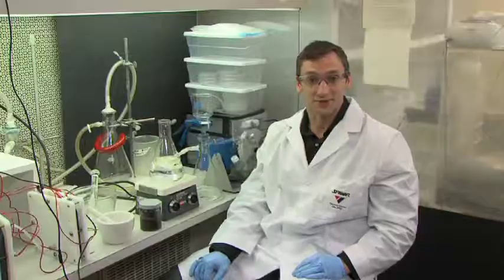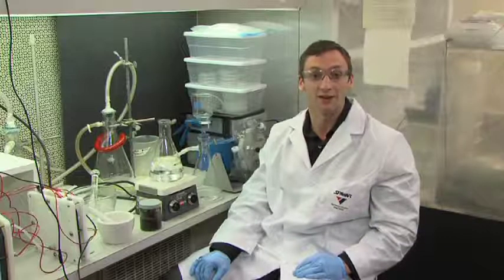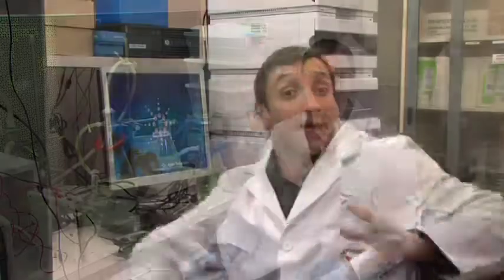The final step, step 5, is the analysis of the TCLP extract in the inorganic and organic areas of the laboratory, depending on the target analytes. In addition to preparing and analyzing the samples it receives, a laboratory also prepares and analyzes a variety of quality control samples, including laboratory control samples, laboratory duplicates, method blanks, and matrix spikes along with the samples. The quality control samples are a measure of the laboratory's ability to meet the method and project data quality objectives.